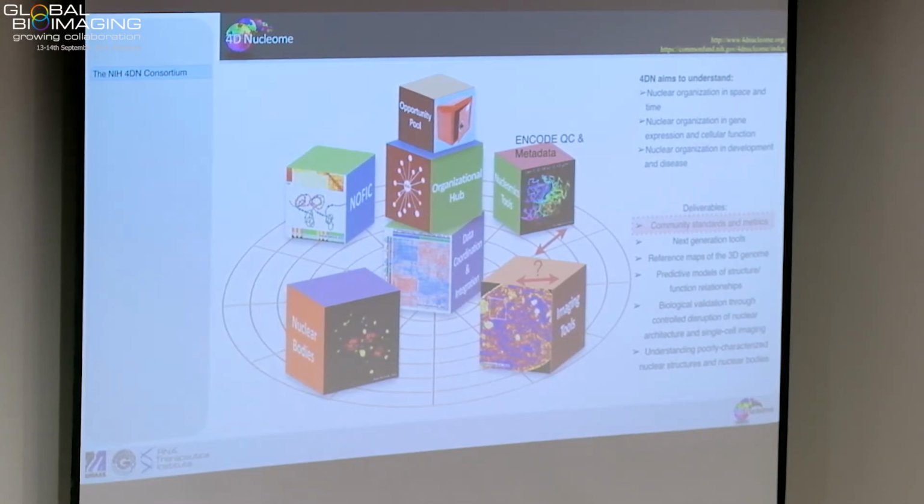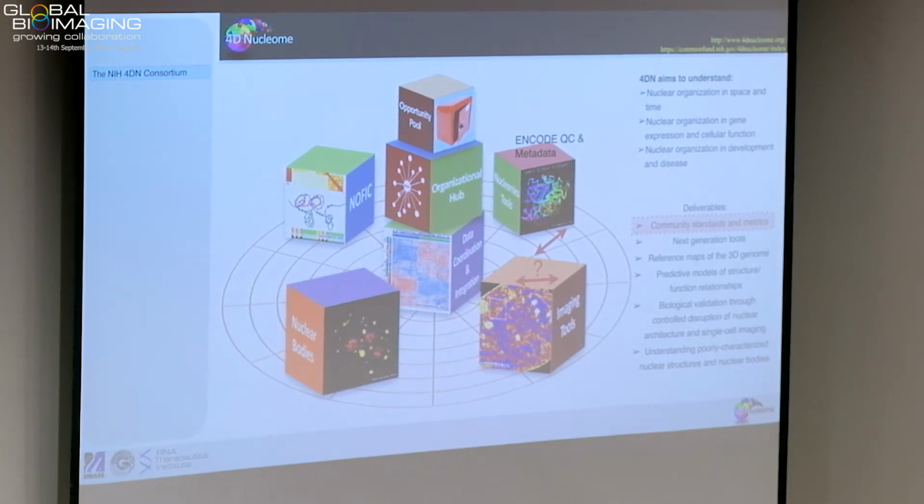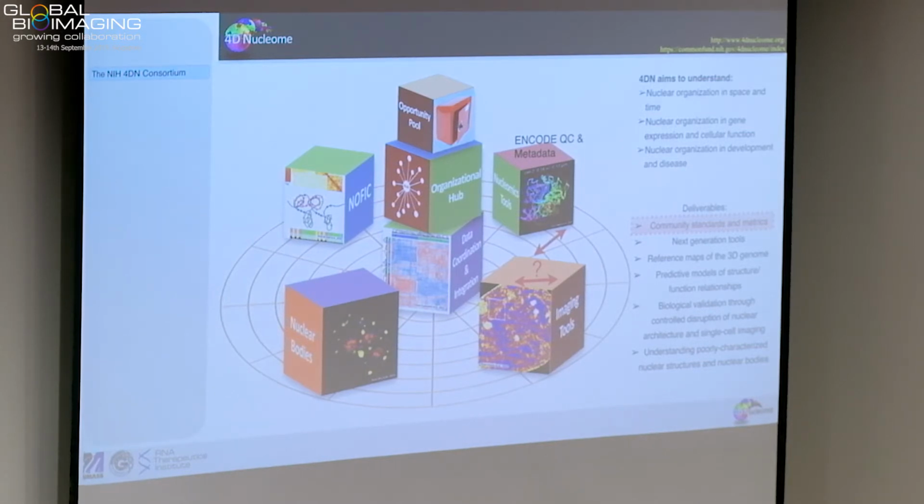One of the questions that was prevalent in the discussion from the very beginning is how do we fuse imaging data and sequencing data? How do we combine the genomics with the imaging? It raised a question for me right away: wait, we have trouble comparing images. How do we now provide data to bioinformaticians that they can model in their genomics data? And how do we provide some sort of a quality measurement for that? How do we make this not a big artifact, because the differences in measurements of what is a surface and what is a particle are so massive?